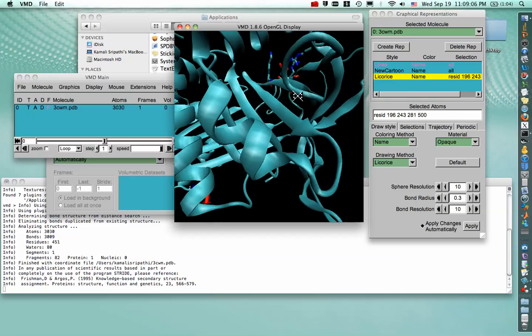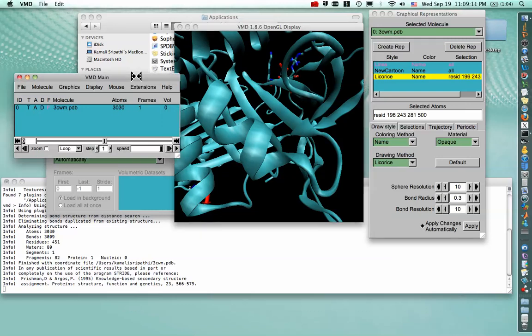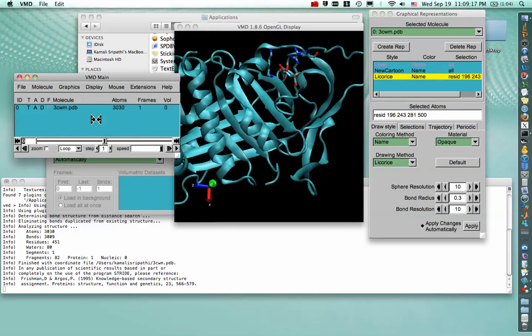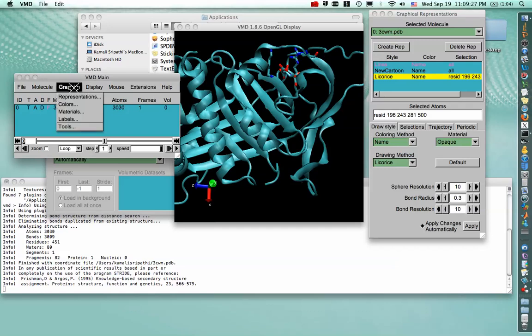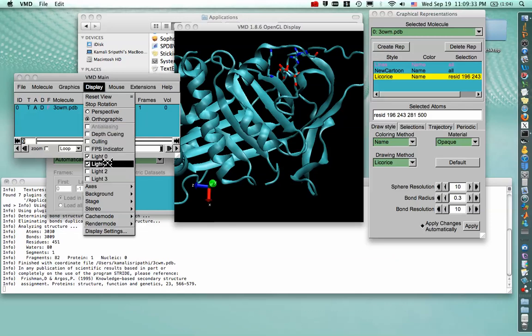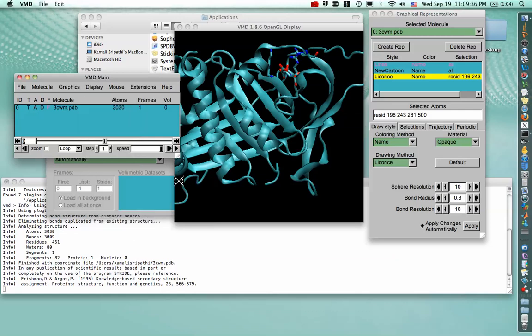But as you can see, VMD zooms a little differently than PyMOL does. So to change the mode of zooming, we can go to Display and change from Perspective to Orthographic. So that way it doesn't feel like our cartoon representation is poking our eyeballs out. And in case things like that bother you, you can get rid of the little axis on the bottom left-hand corner by going to Display, Axes, and turning them off.